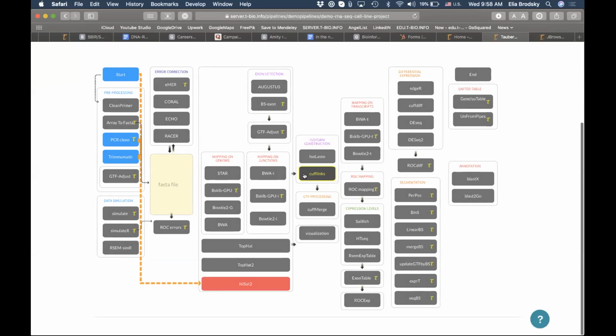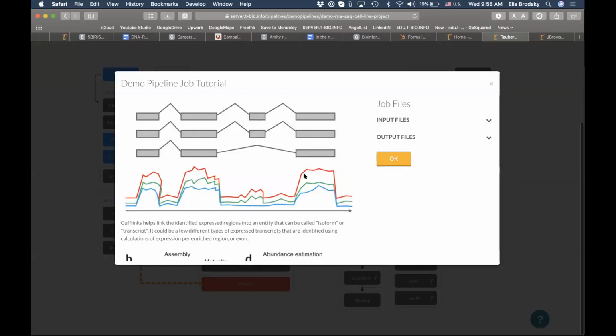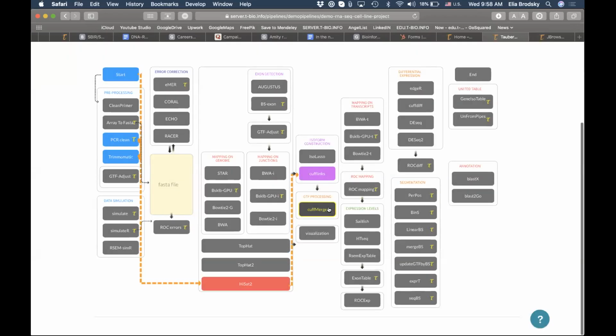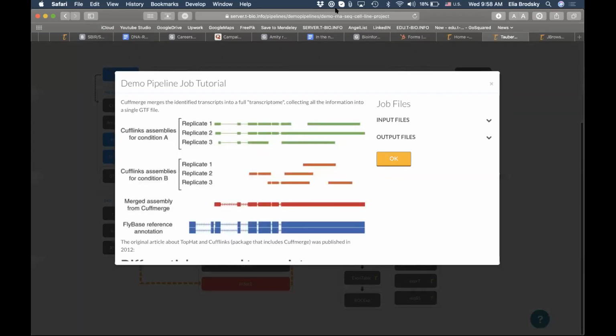And so we need to now construct these isoforms by looking at the variability, because some samples will have some exons present, others will not, and so we need to have a full list of all of those possible isoforms. And then we will use that understanding of the isoforms to actually generate a new GTF file.